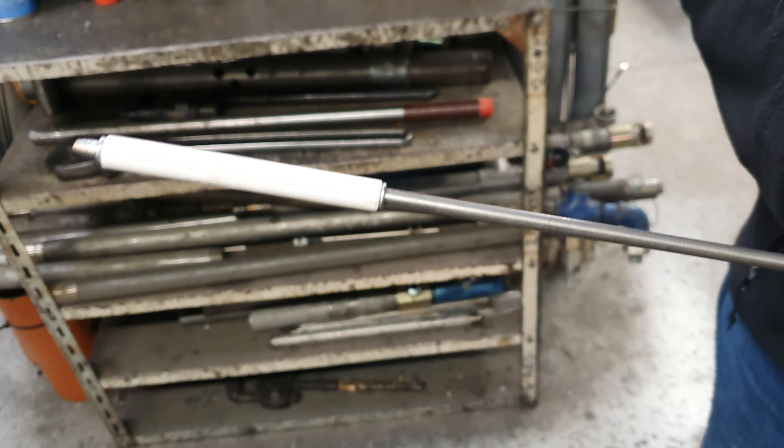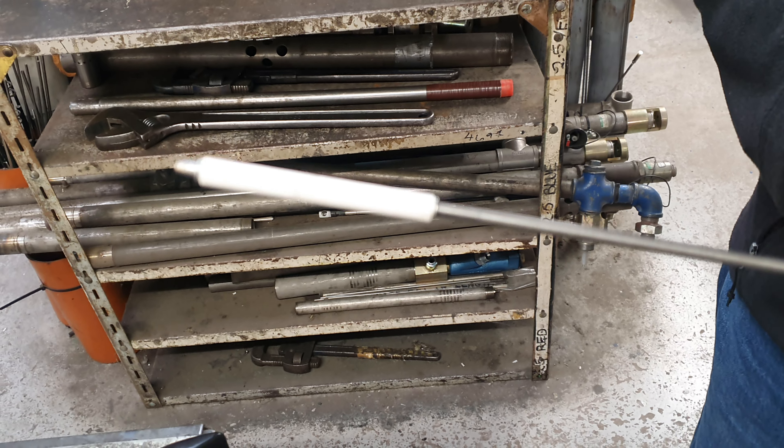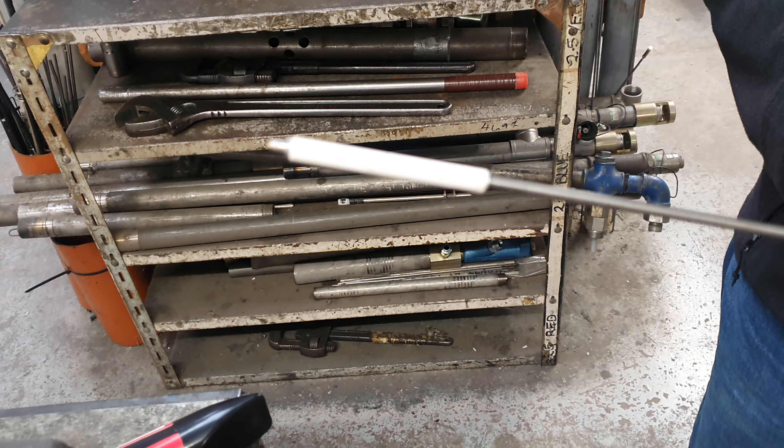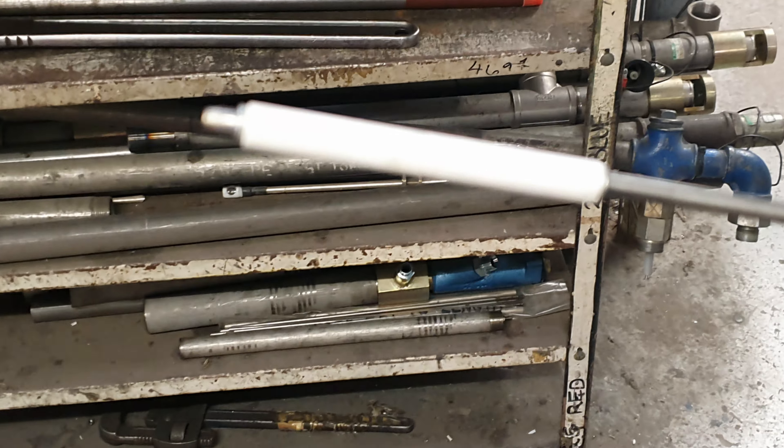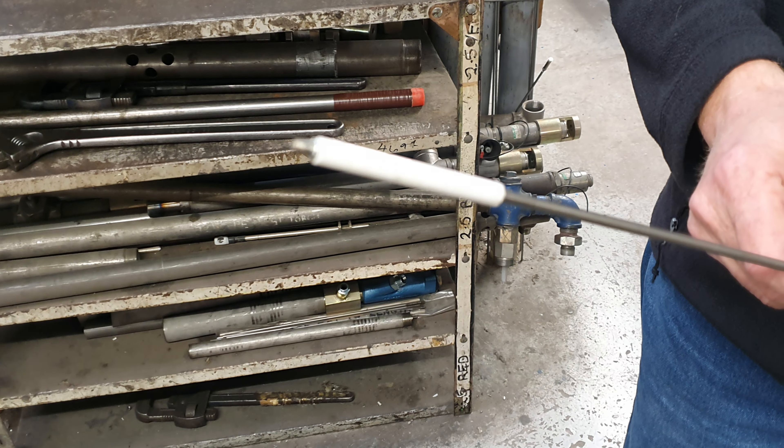If you've got a broken insulator here, simply pull it forward, replace it, and then replace the clip. It's hard to see in the video — there's a clip at the front holding the igniter in position.